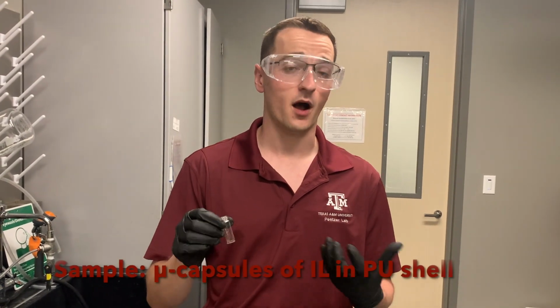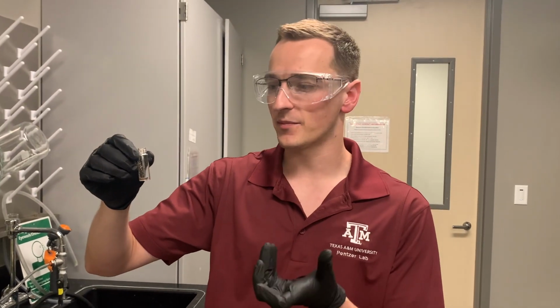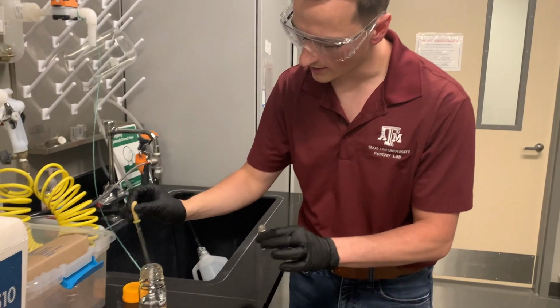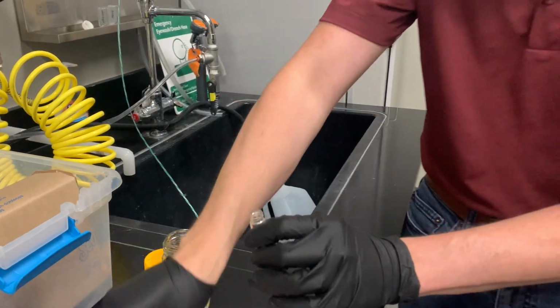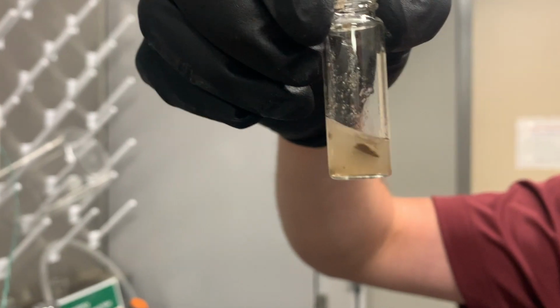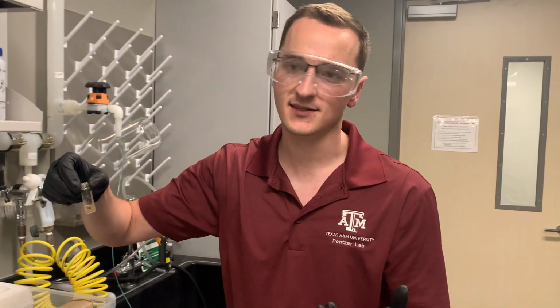The sample that we're going to be measuring today are microcapsules of ionic liquid with a polyurea shell. I've placed about 50 milligrams of the capsules into this vial. At this point, we can go ahead and disperse them gently in about a milliliter of methanol, like so. You can see that the capsules, after they sit for a while, tend to aggregate a little bit. So we can go ahead and sonicate them very briefly, just about 5 seconds, in order to break up some of the clumps.